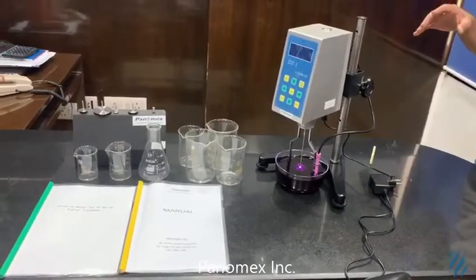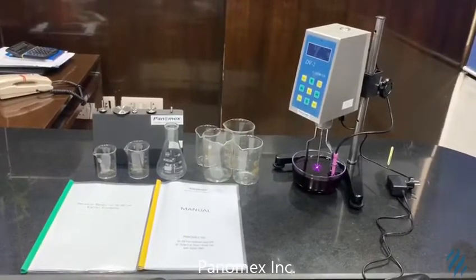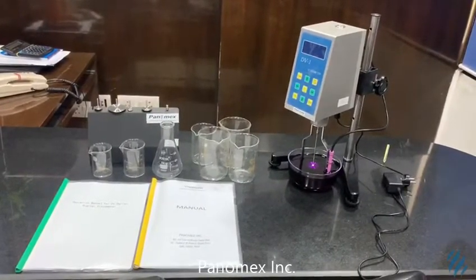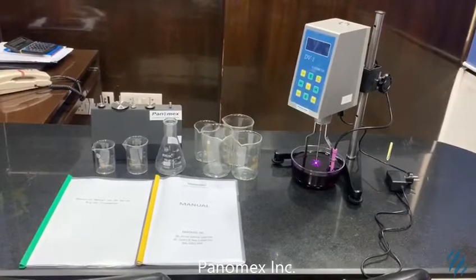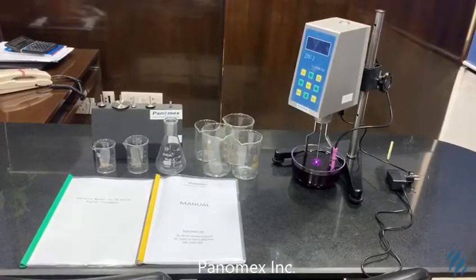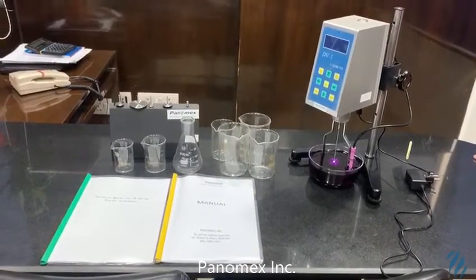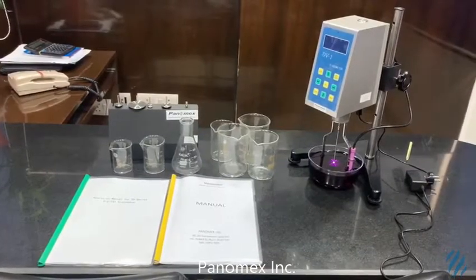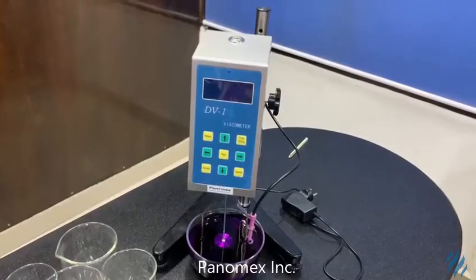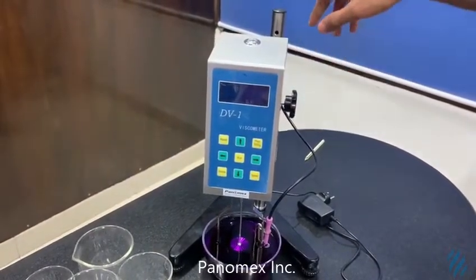Welcome to Panamax. Today we are going to tell you about a viscometer, which is an instrument used to measure the viscosity of a fluid. For liquids with viscosities which vary with flow conditions, an instrument called a rheometer is used. Thus, a rheometer can be considered as a special type of viscometer.